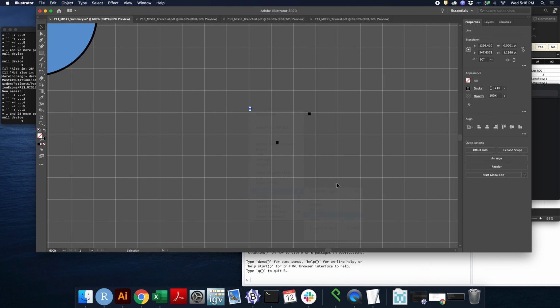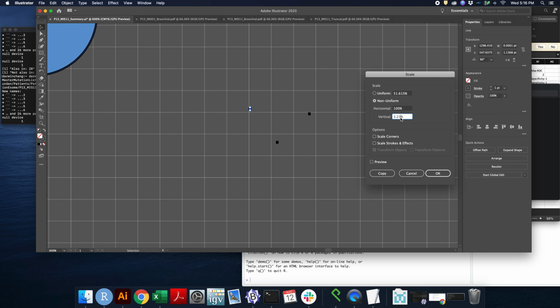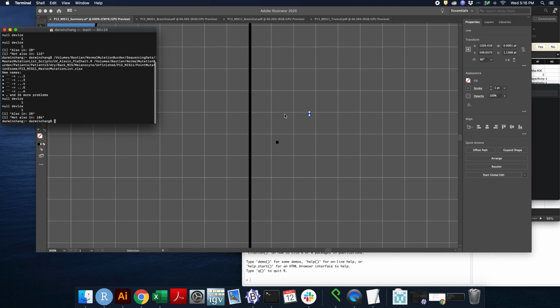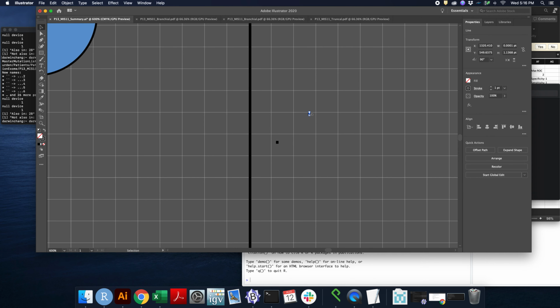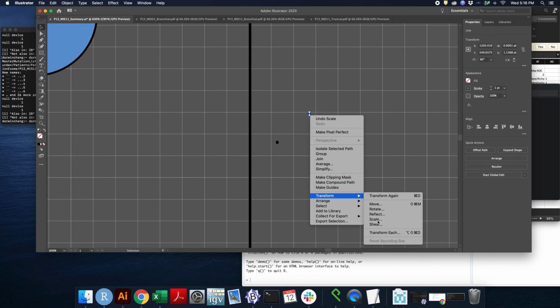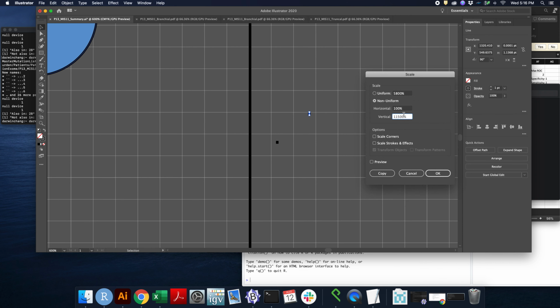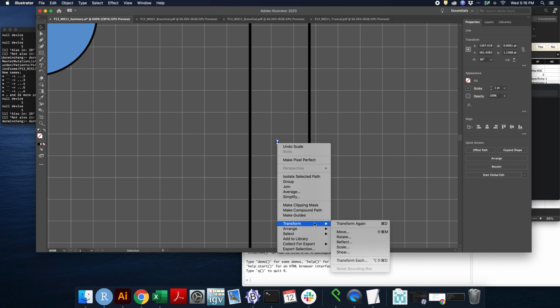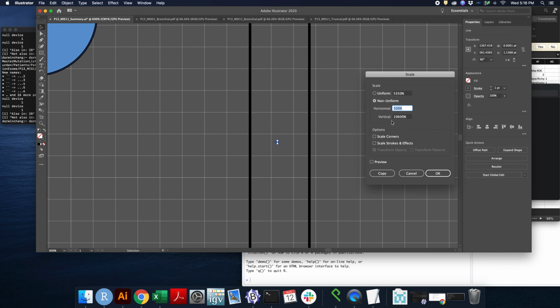So let's scale to 115 times 100, 4%. And for MIS11, on the right, 106. And then for the middle, or the truncal part, it was 28. So 2800.